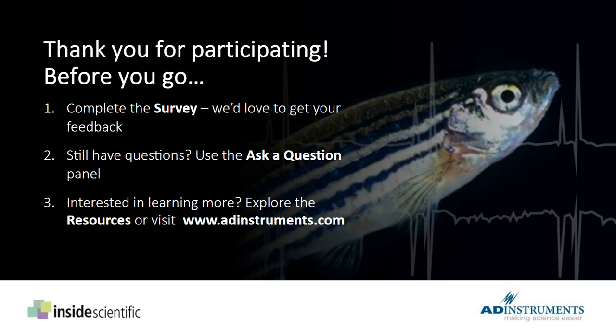Mm-hmm. It's actually funny that you say that. We do have a follow-up question from one of the questions earlier, and just to be respectful of everyone's time, this is going to be the last one that we answer. So the question is, did you observe any arrhythmia, such as polymorphic ventricular tachycardia, related to QT prolongation?